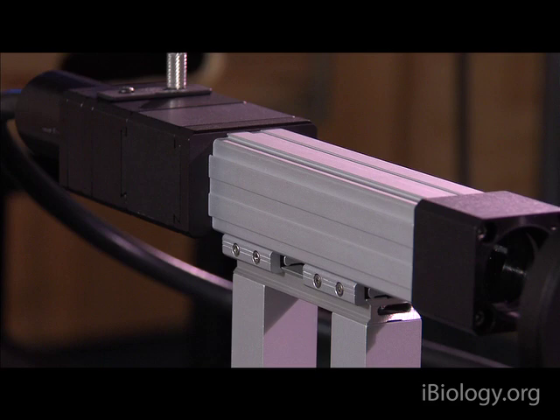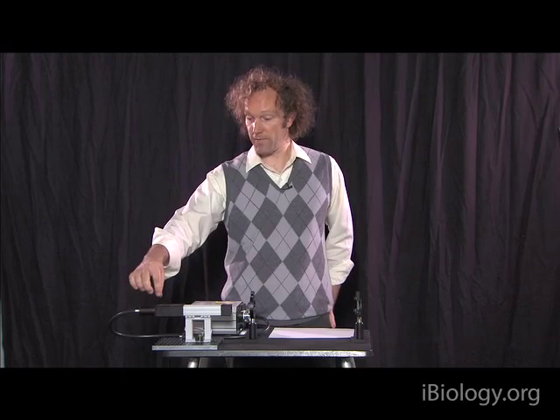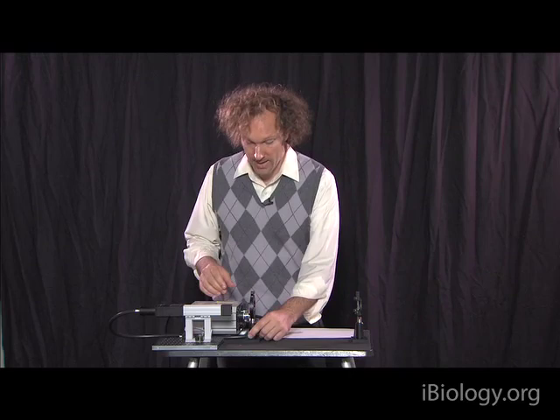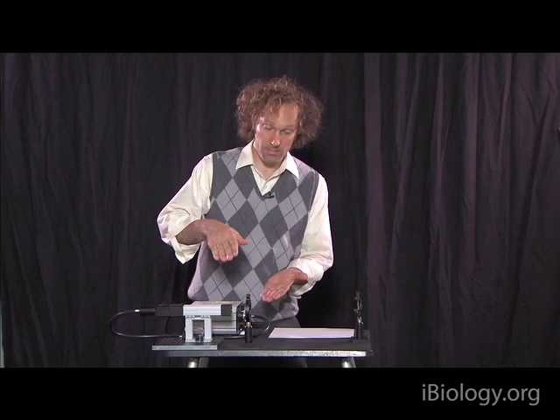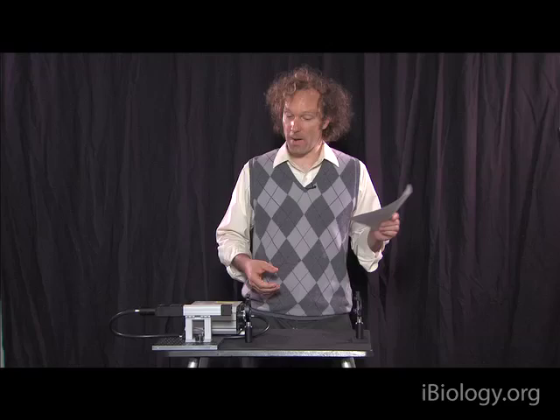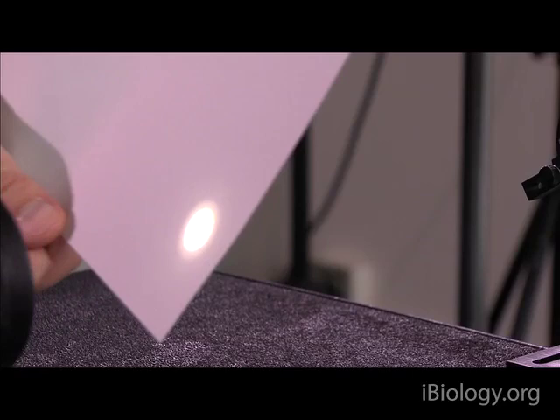A collimator is simply a single lens that takes the light emanating from this fiber and creates a parallel, collimated ray. So much like the diagrams, in which rays passing parallel will be converged to a focal point by a positive lens, we can test that out by taking one of these two lenses and moving it in the path of the light. What we would expect to see is, at some position past the lens, a spot of tightest focus. We can identify that using a simple piece of paper, moving it from the lens position until we see the tightest spot.